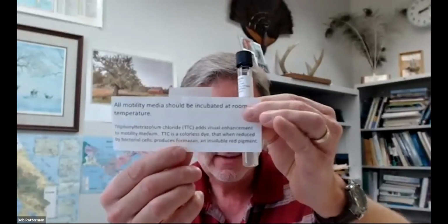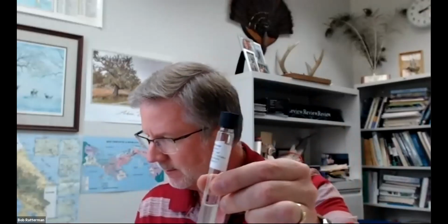But in essence, it just simply says that this TTC that's been added to this tube adds visual enhancement to motility media. It is a colorless dye that, when reduced by bacterial cells, forms formazan, an insoluble red pigment.